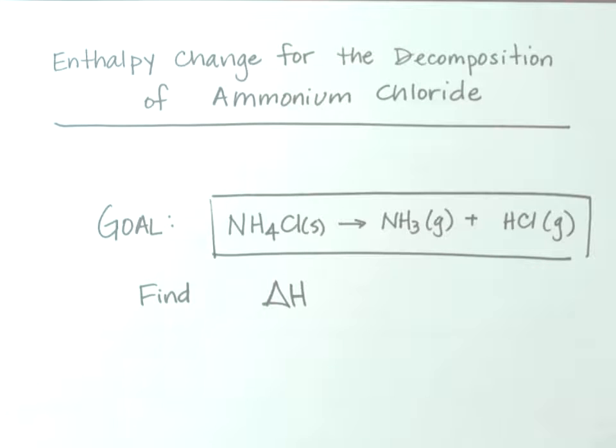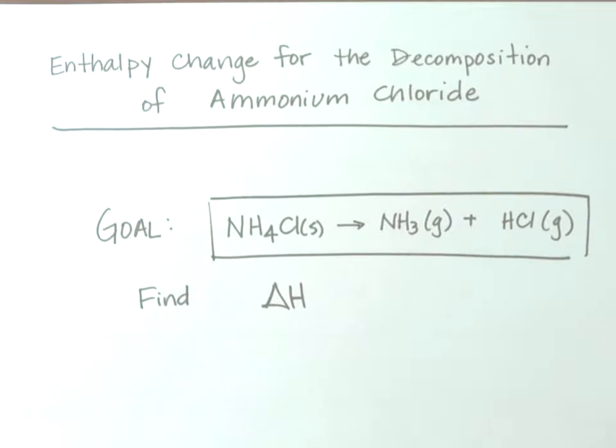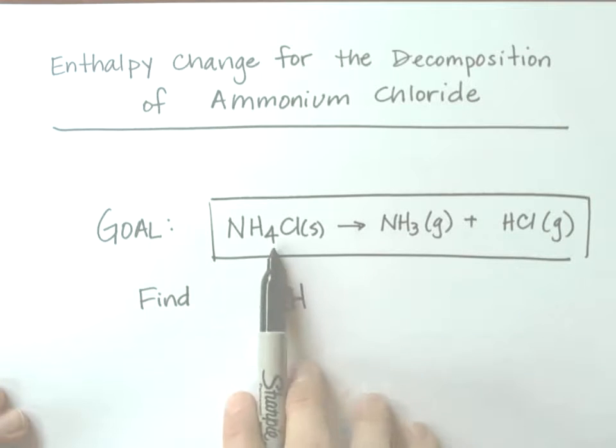Okay, the purpose of this video is just to give you an overview of what's going on in this lab, the enthalpy change for the decomposition of ammonium chloride. So I'm not sure that it's clear in late night labs what you're doing all these different experiments for. So I wanted to just give you an overview and then talk a little bit about the assignment.